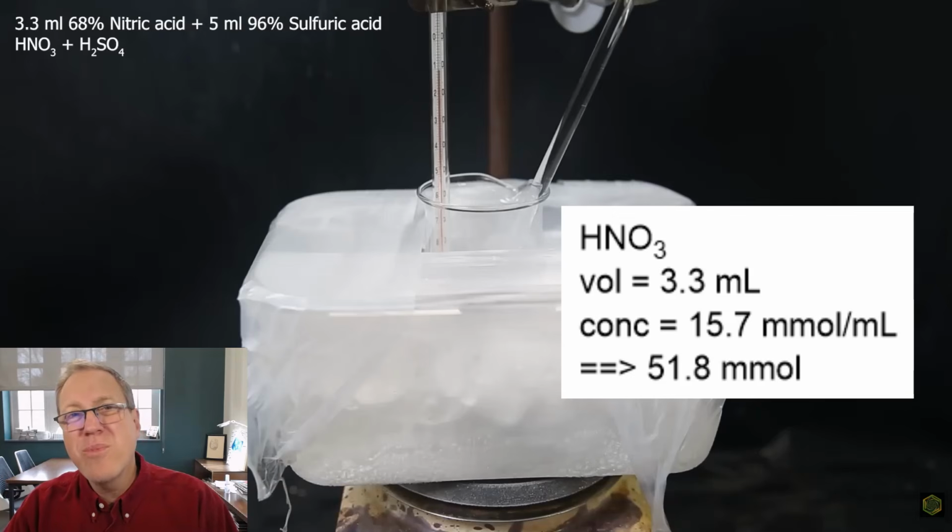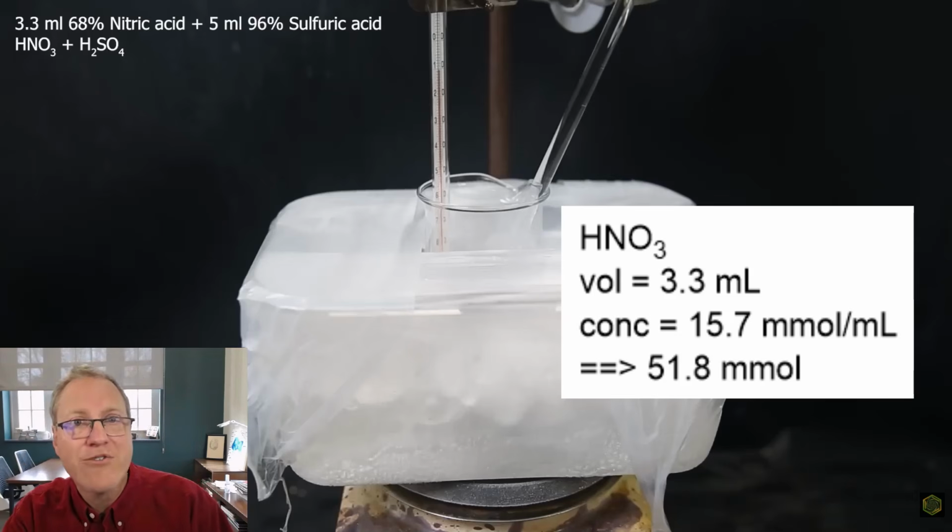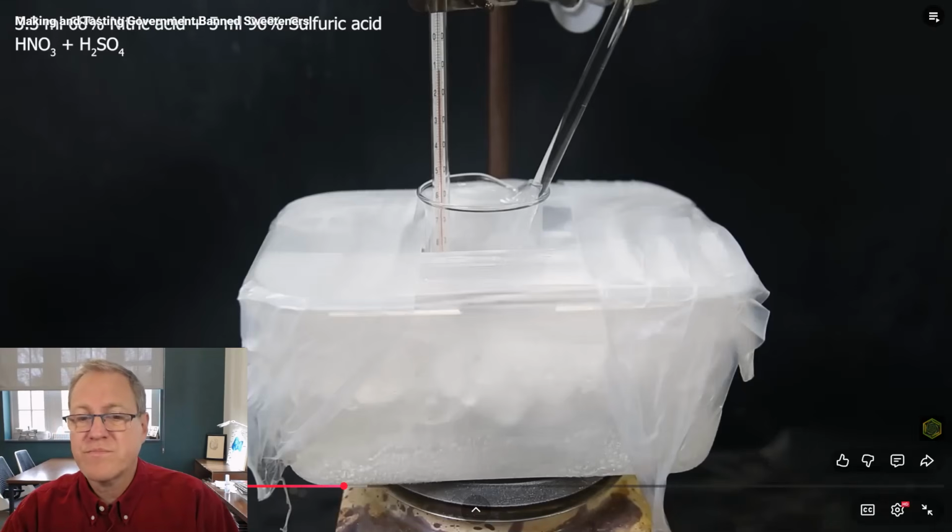He has 3.3 milliliters of 68% nitric acid. If you go through the math, that's just over 50 millimoles of nitric acid. I don't have enough experience doing these nitrations, trying to control the amount of nitric acid, to know if you can literally try to do 1-to-1 nitric acid, if that stoichiometry is that sensitive. But he probably has about 30 millimoles of starting material, and he's got somewhat of an excess of nitric acid in here. 5 ml of 96% sulfuric acid.